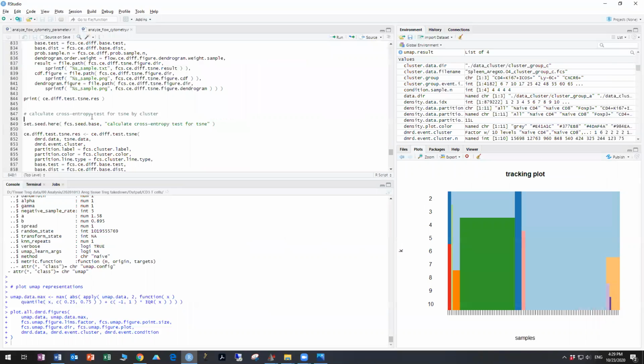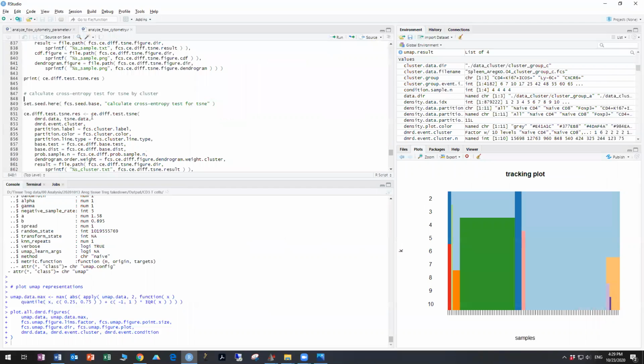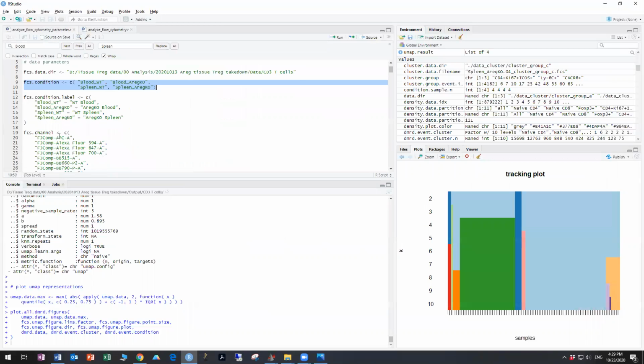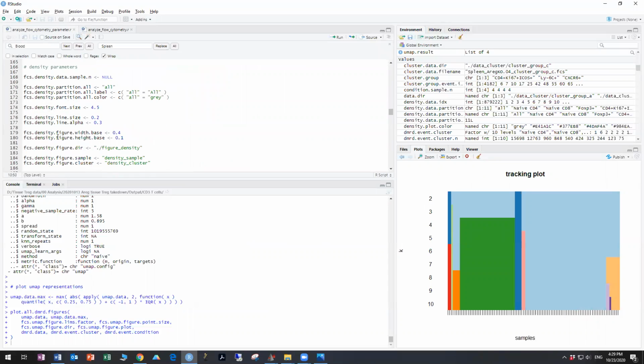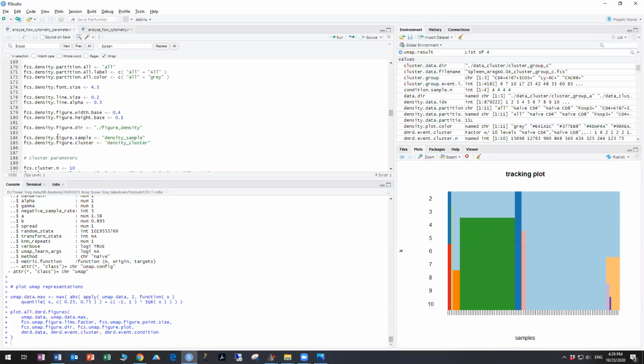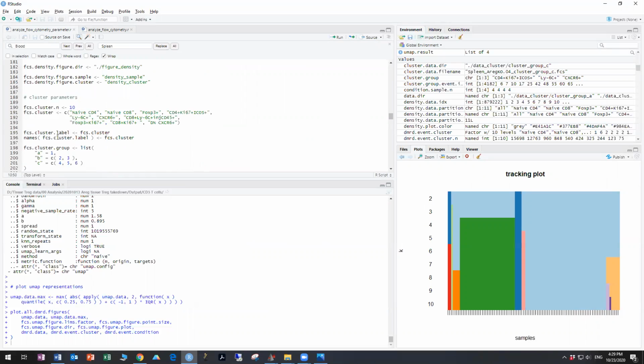Right, we're going to proceed with the tSNE diff. And here, it's pretty important to set some of the parameters in your parameter file because this is really a heavy calculation for your computer. It will probably crash on most computers if you try to run more than about 100,000 events.